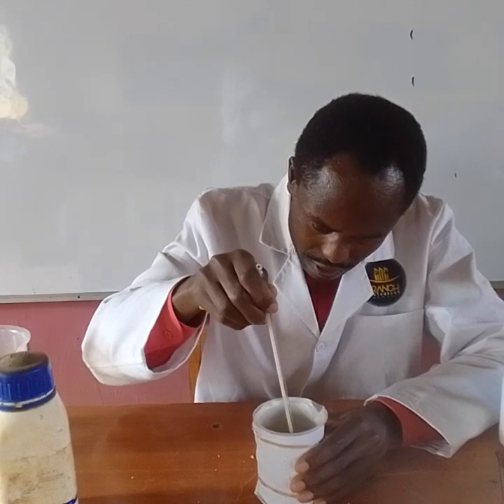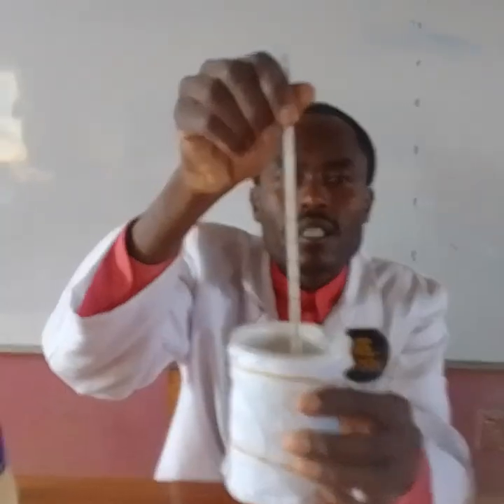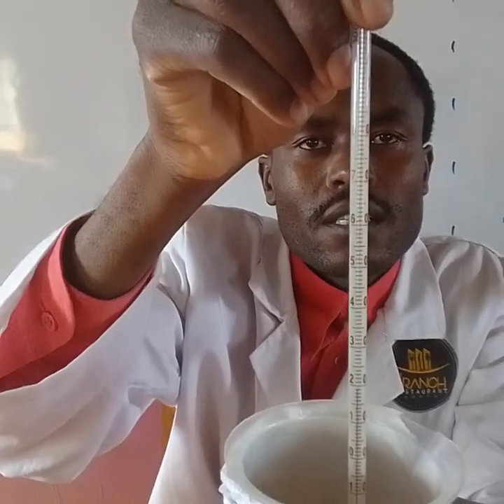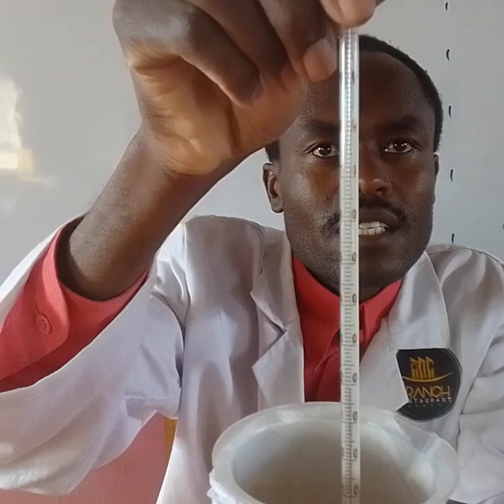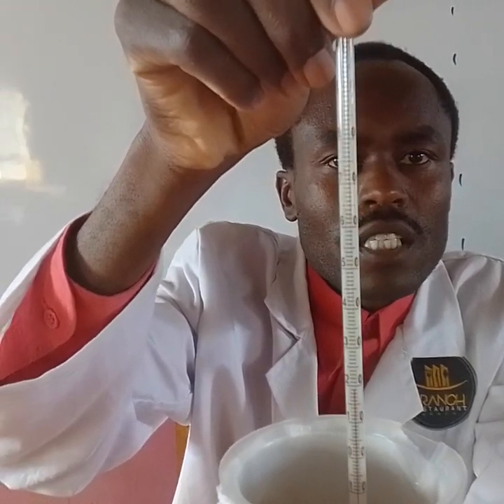The solid has dissolved. Then let us read the temperature. The final temperature is 19. Are you able to see, my student? It is 19.0 degrees Celsius. Thank you. So what has happened, my student?